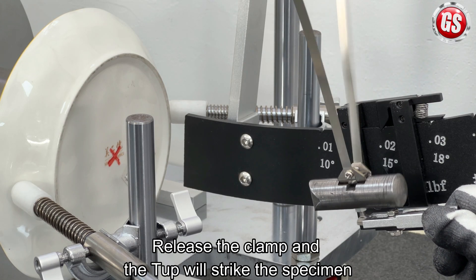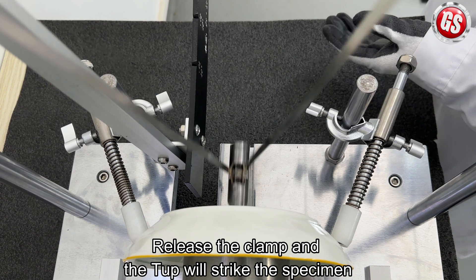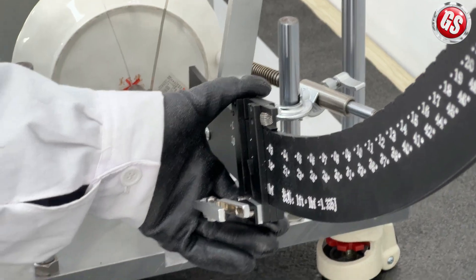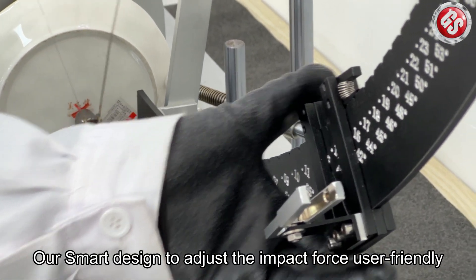Finally, release the clamp and the tup will strike the specimen. Our smart design allows you to adjust the impact force — user-friendly.